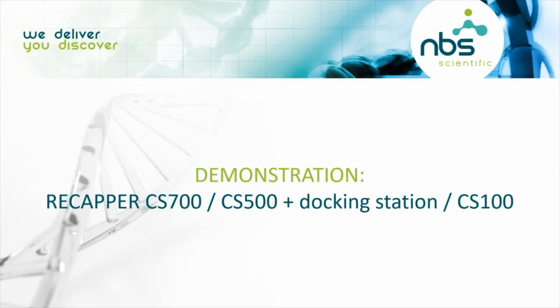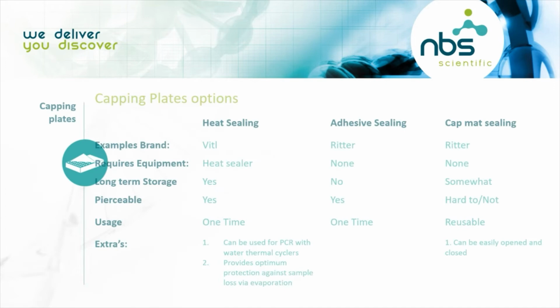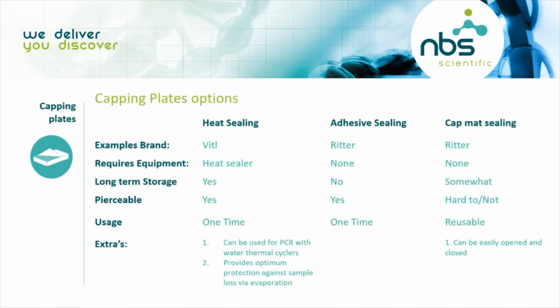Thank you, Martin and Gracia, for this demonstration. And the final topic we will talk about is capping racks or plates. A few examples of how we can cap seals. A few examples of how we can seal plates or racks.